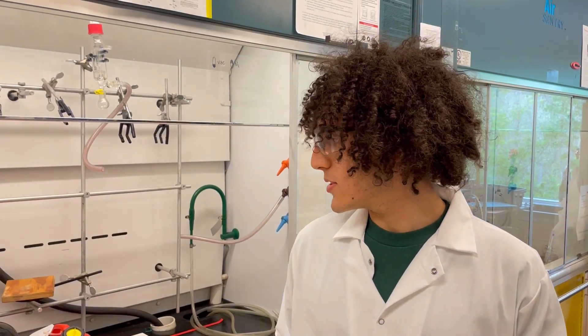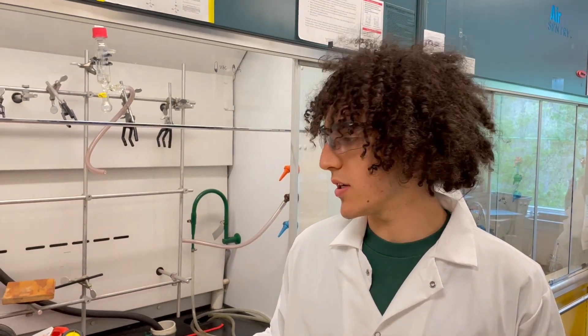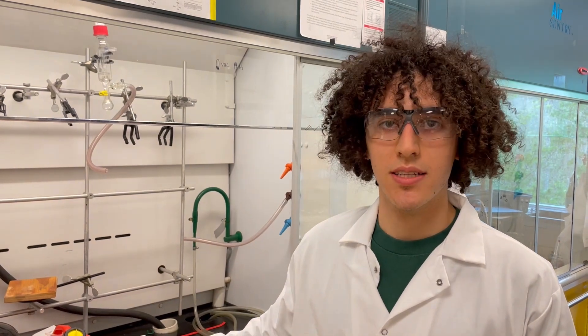Hello. Today we're going to be talking about proper safety protocols for working in a fume hood in a scientific laboratory.